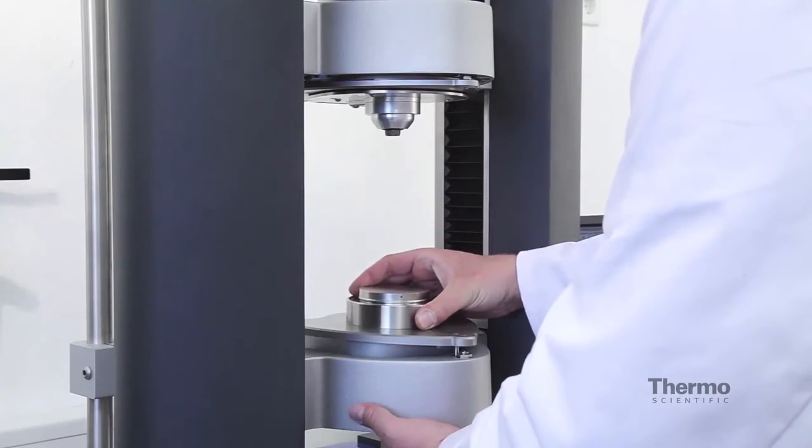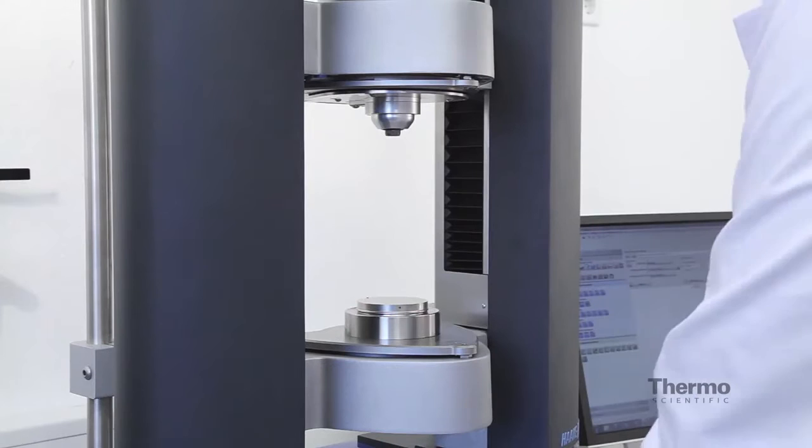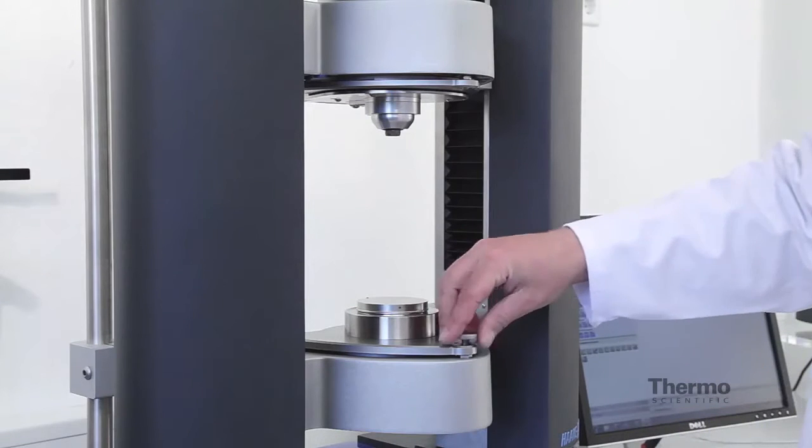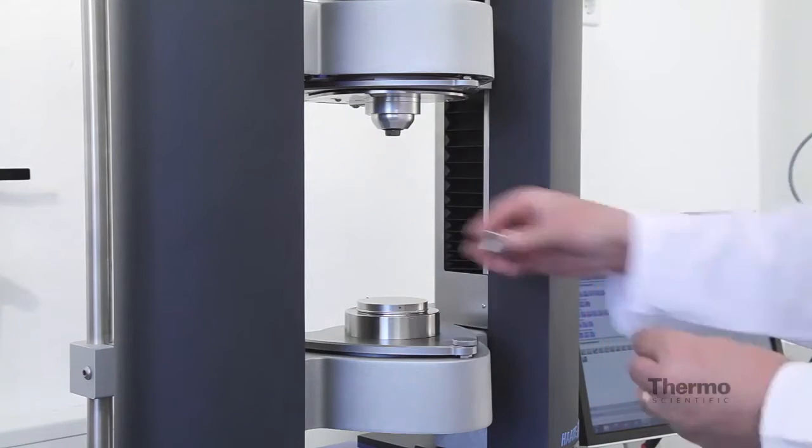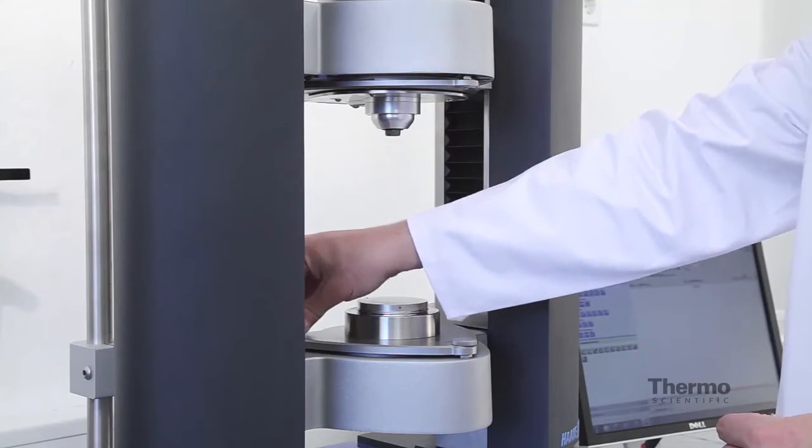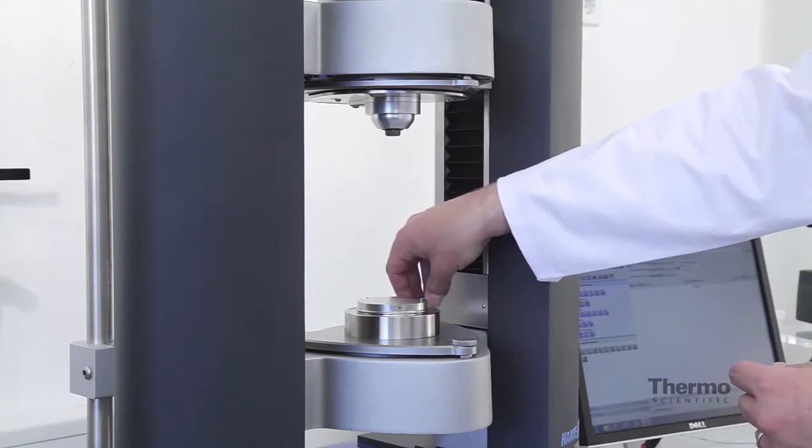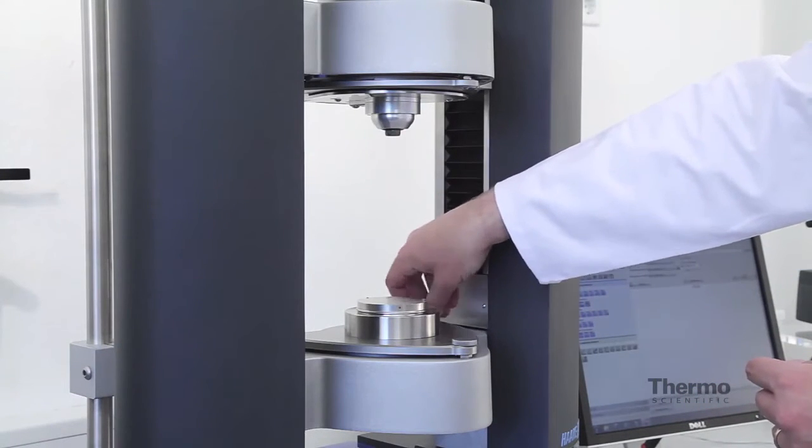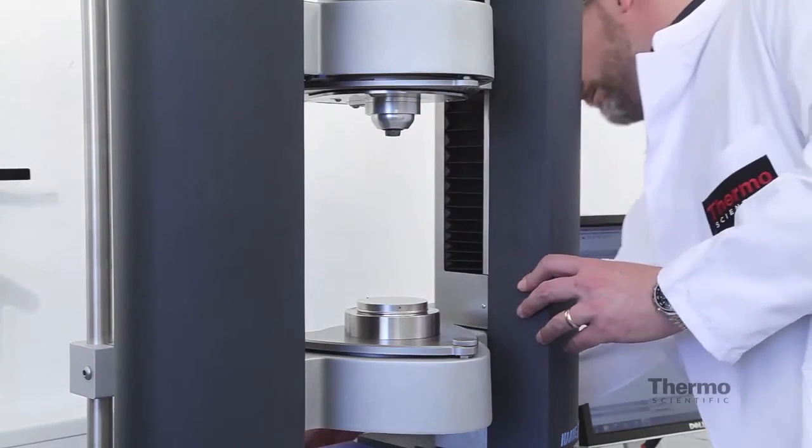For instance, shown here the implementation of a temperature control module, here the Peltier plate, by just locking it with three locking screws manually before then connecting it to the frame of the system with quick connect adapters.